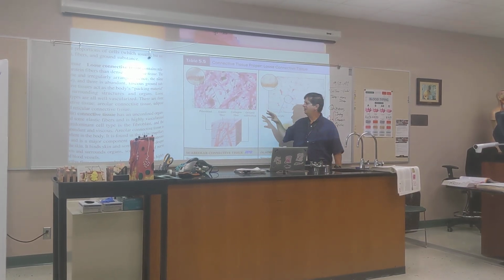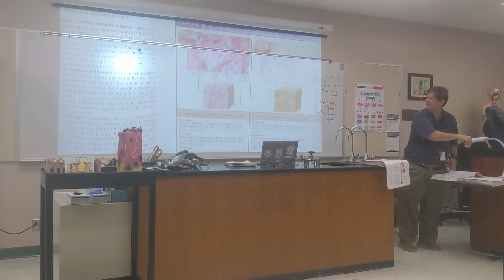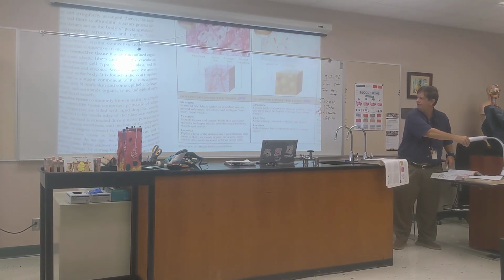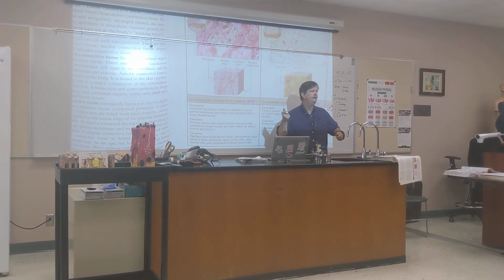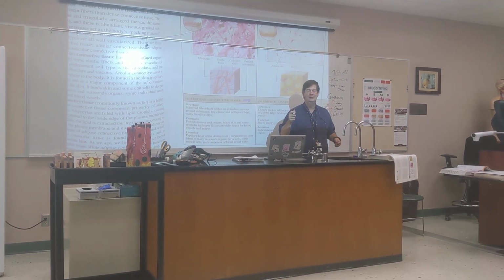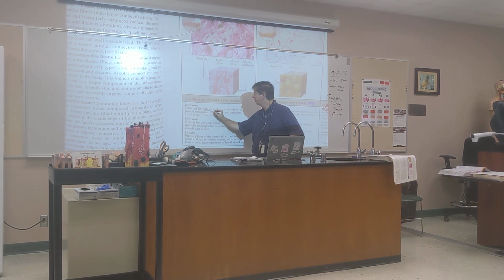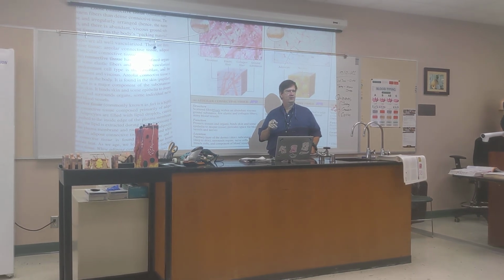Okay. This is areolar connective tissue, and let's just do what they say right here, talking about it. Structure. Scattered fibroblasts. Oh, we're going to introduce a new suffix. Everybody ready for this one? When you see blast, I'm going to give you two words that I want you to think of.